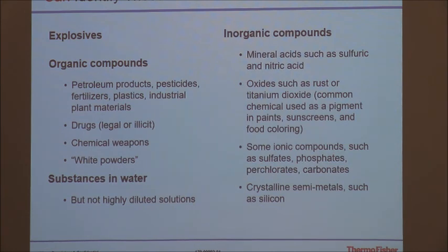Now, if you were to get that result, let's say it said calcium nitrate, sodium nitrate, magnesium nitrate, and so forth. It would come up in a green screen result and list most of them out. A green screen, you'll see it again on the slide, means two things. Positive match, one chemical. If you did vegetable oil, the device is going to come back and go cottonseed oil, safflower oil, corn oil. It's going to be like, hey, it's a vegetable oil. It's going to be highlighted in green. The device is saying, it's a vegetable oil.